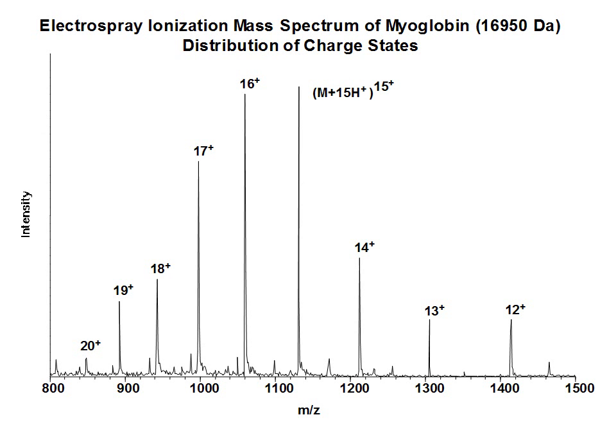As already mentioned, electrospray ionization mass spectrometry leads to multiply charged molecules. This is very prominent for macromolecules such as proteins. Let's look at myoglobin here, a molecule with 16,950 Dalton molecular weight. This is a spectrum of only myoglobin, but we see many peaks. These peaks are due to different charge states of the same molecule, and the charge states are due to protons being attached to the molecule during the ionization process.